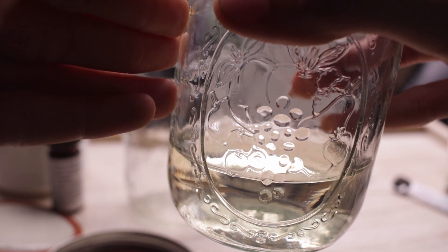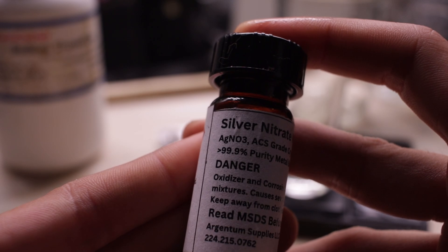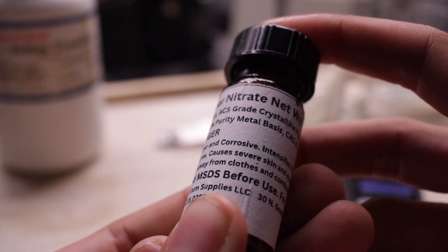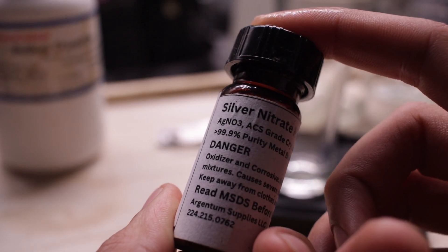In this video we do have to conduct chemistry with some very reactive and volatile compounds, so as a professional microbiologist scientist I am conducting this reaction in a safe and controlled environment with personal protective equipment.